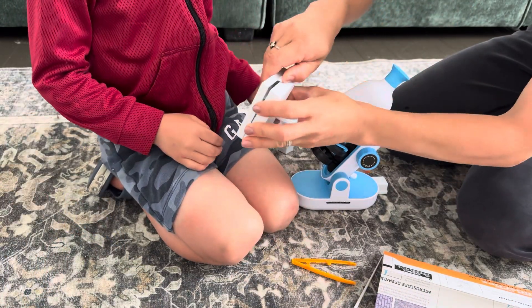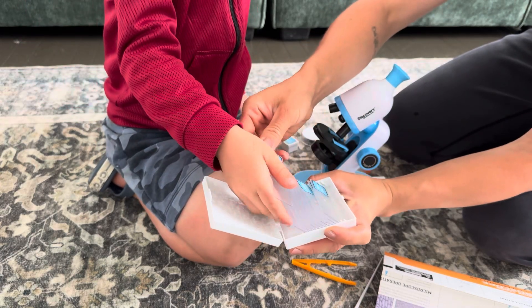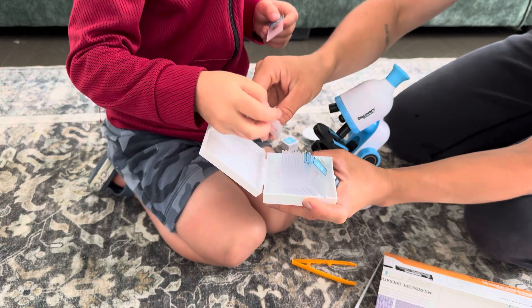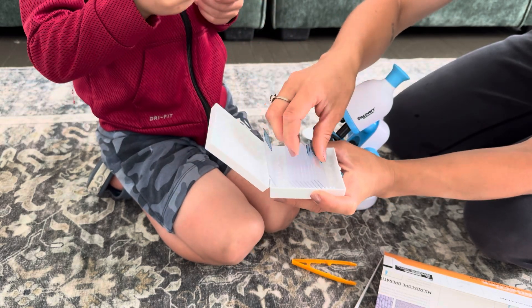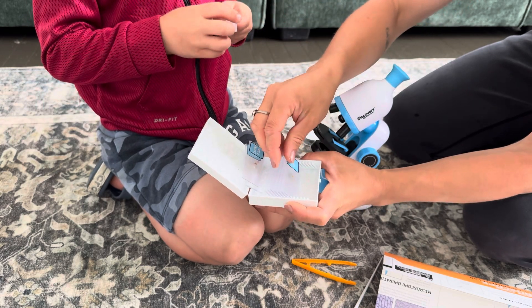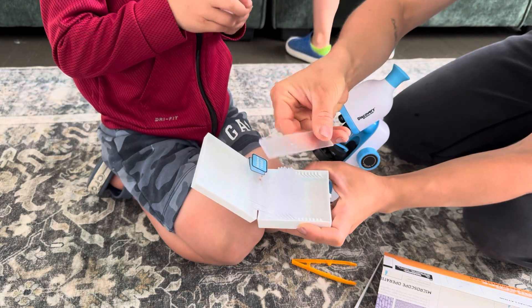Let's see what is inside the slides. Wow guys, look — we have a bee wing, we have sea salt, that is so cool! We also received shrimp eggs, camel hairs, and camellia pollen. Wow! And these are additional slides where you can put your own specimen.